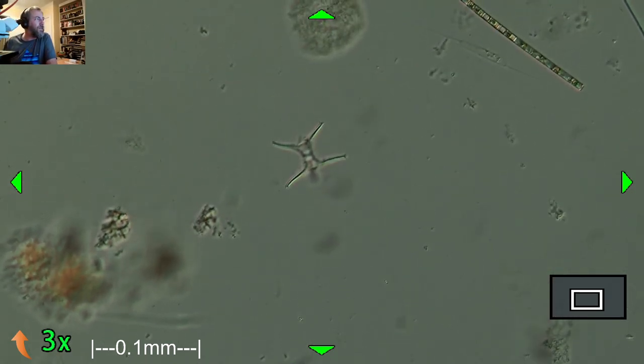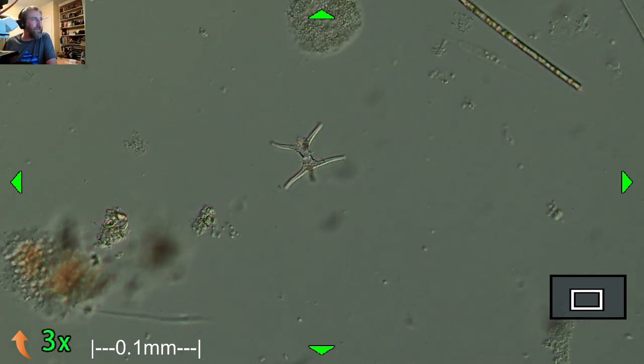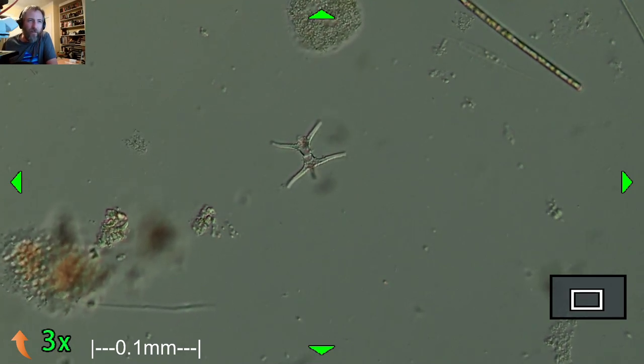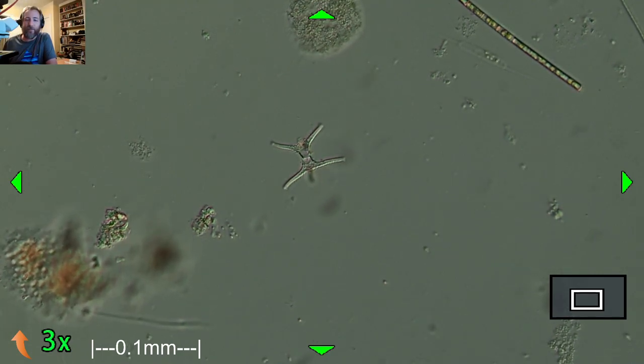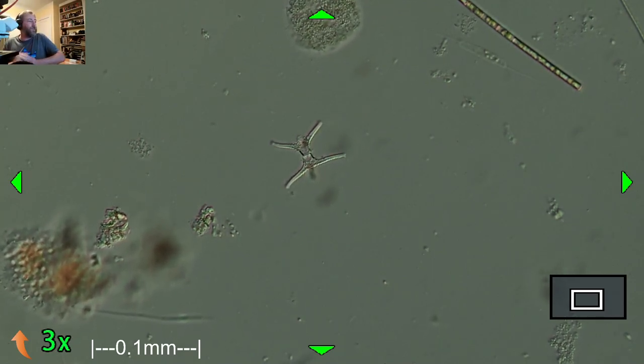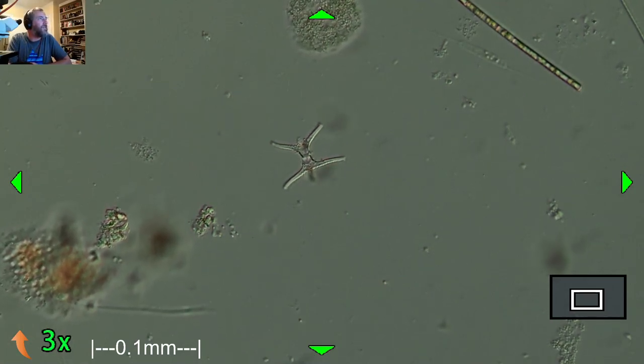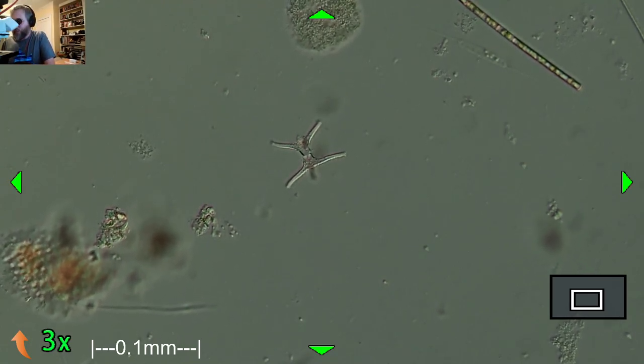You can see it sort of has like a three, a triangular-shaped spaceport. Yeah, I don't know what's going on. Sound was going crazy. Maybe I'll just turn off the pretzel rock because it's acting bizarre. If it starts jumping around in volume again, let me know.